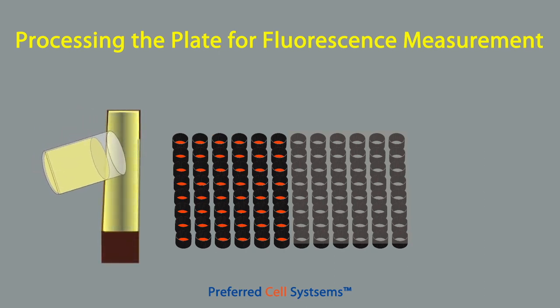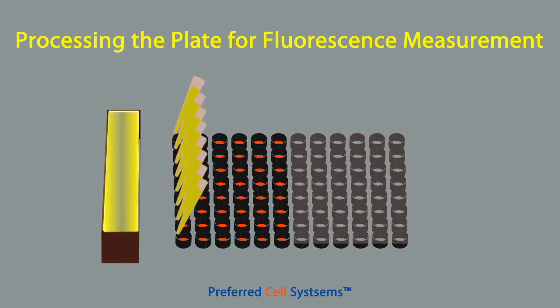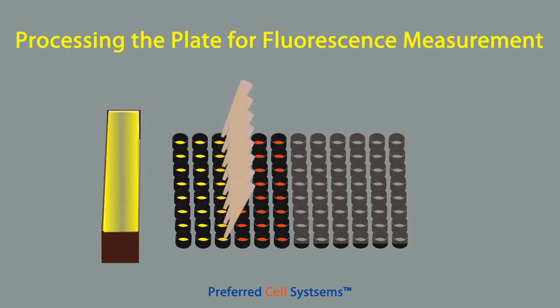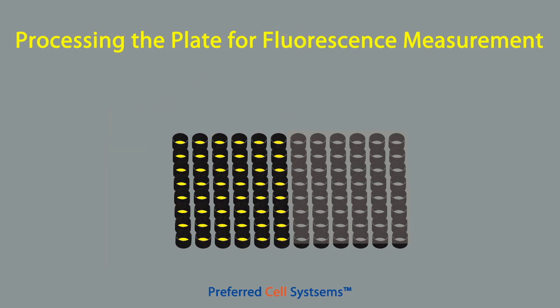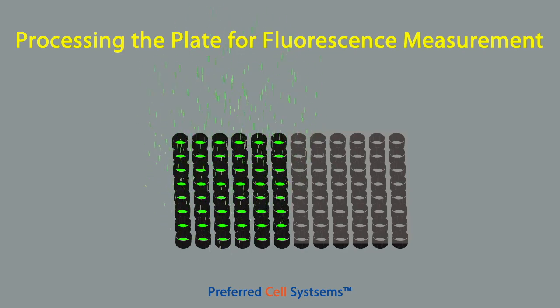Pour the dissolved substrate into the reagent reservoir. Using a multi-channel 8-channel pipette, dispense 0.1 milliliters of the dissolved substrate into each well and mix gently by pipetting, making sure no bubbles are produced. Transfer the plate back to the 37°C incubator. The fluorescent signal will start to develop after about 30 minutes and should reach a maximum after 3 hours. A 2-hour incubation is usually perfectly sufficient; you can remove the plate at any time to measure fluorescence and determine the optimum time for the cells being assayed.